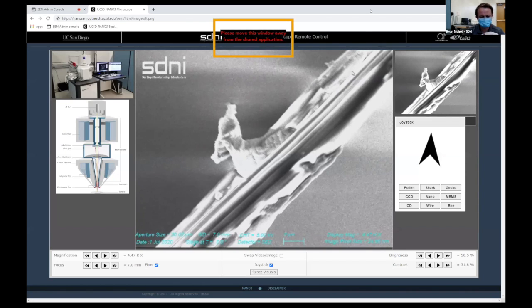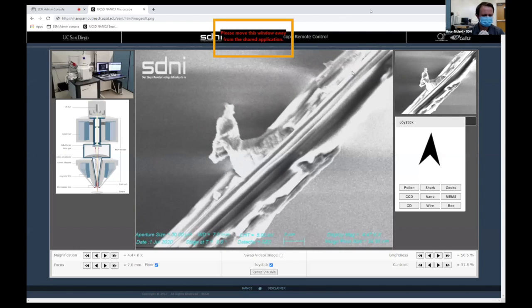Again, don't have a lot of time to really go into detail today, but that is an interesting lesson that we could explore.